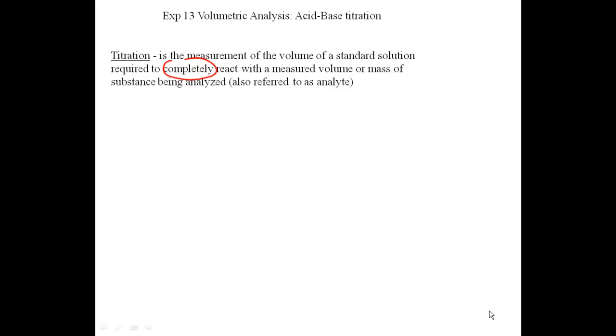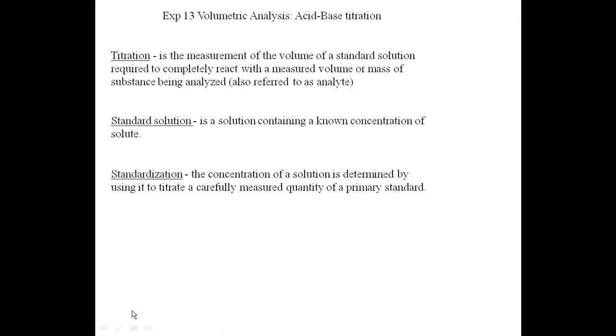Another important word in this definition we want to look at is standard solution. A standard solution is a solution containing a known concentration of solute. Typically, it's a strong acid or a strong base. The concentration of a standard solution is determined by a process called standardization. Standardization is a process in which we determine the concentration of a solution by titrating it with a carefully measured quantity of a primary standard.